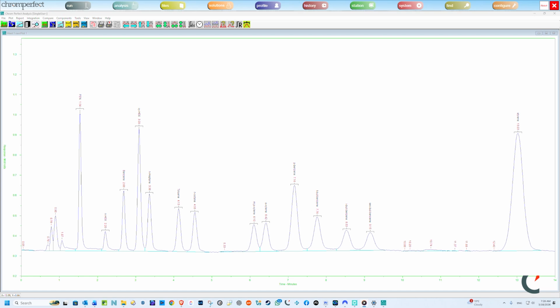Annotations allow the user to place explanatory notes or markers onto the chromatogram display. You can add or edit annotations from the Plot menu or the right-click Quick menu. These can be used to highlight unusual peaks, document observations, or provide additional context for reviewers. Annotations become part of the visual presentation of the chromatogram and can be useful when preparing results for reporting or collaborative review.